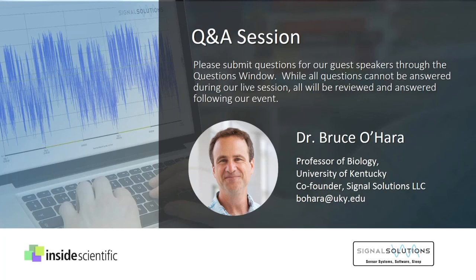Obviously, if only one animal is awake and the other is sleeping, that does tend to disrupt the signal, so we can't always pull that out, but we're working on algorithms that can actually separate that kind of information. That's, again, in process. So we think we could get some crude data of group sleep, group wake. Getting detailed individual animals within a group is in progress.